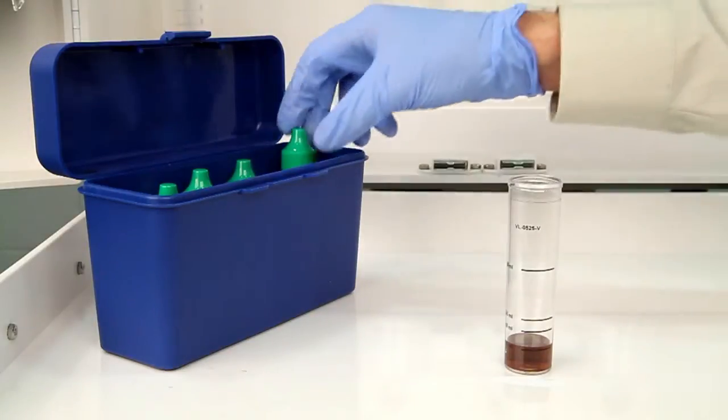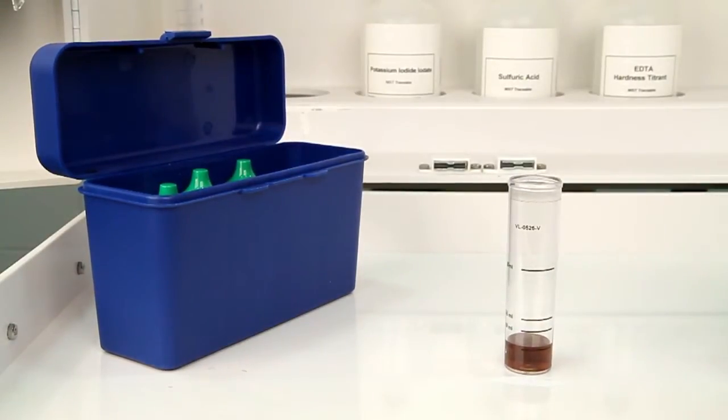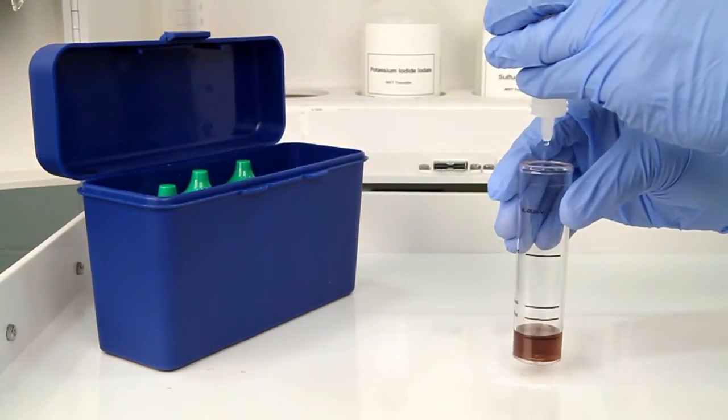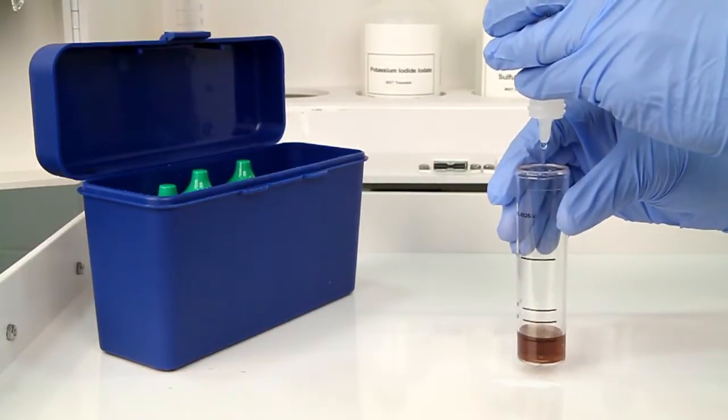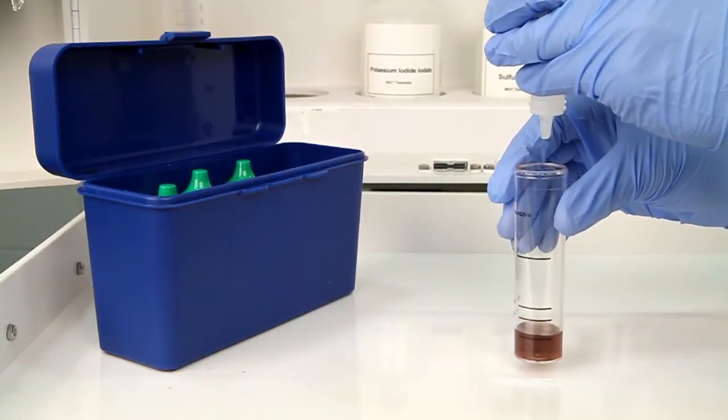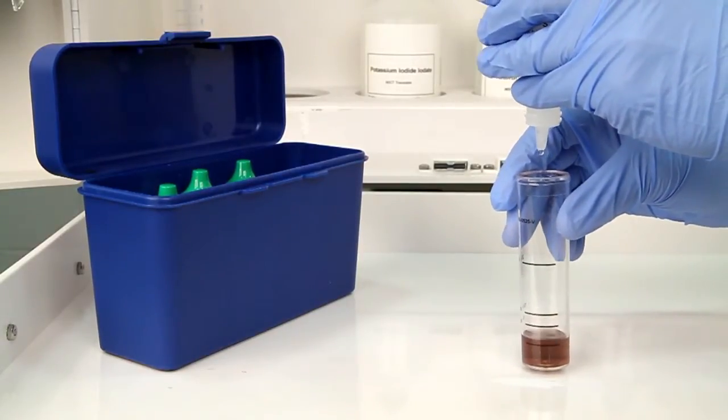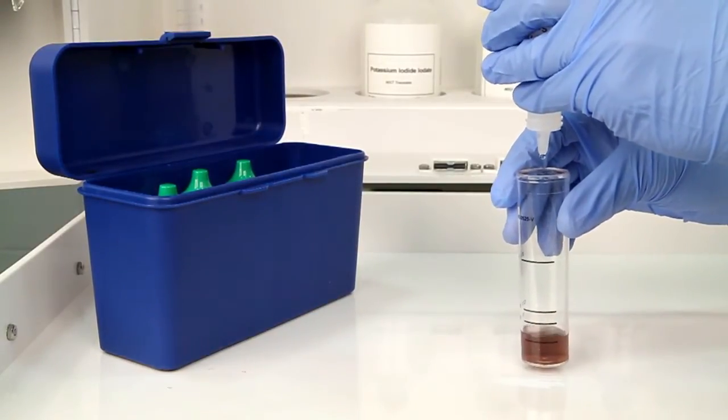The next step is to perform the titration using sodium thiosulfate titrant high. Each bottle of titrant is labeled with the equivalency and sample size it was manufactured for. It's important to make sure you have the proper titrant and the proper sample size for this titration. The bottle contains a dropper tip, so it's important to hold the bottle vertically to get a consistent drop size.